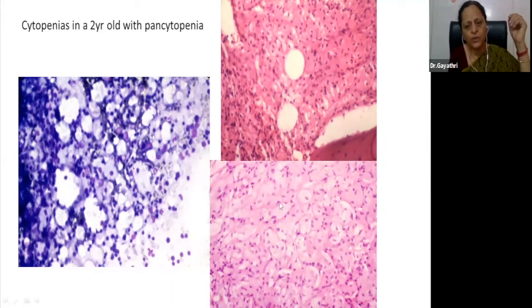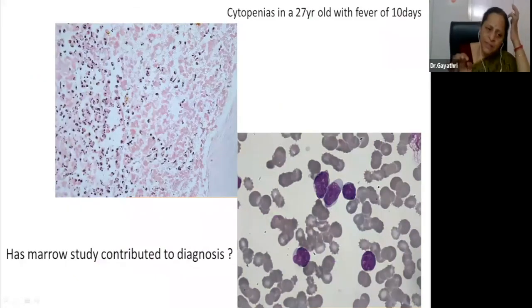Trephine sections in 2 cases of Gaucher disease. You should be a bit aware to pick up these empty looking cells on marrow cytology. You should look at low magnification as well as higher magnification.